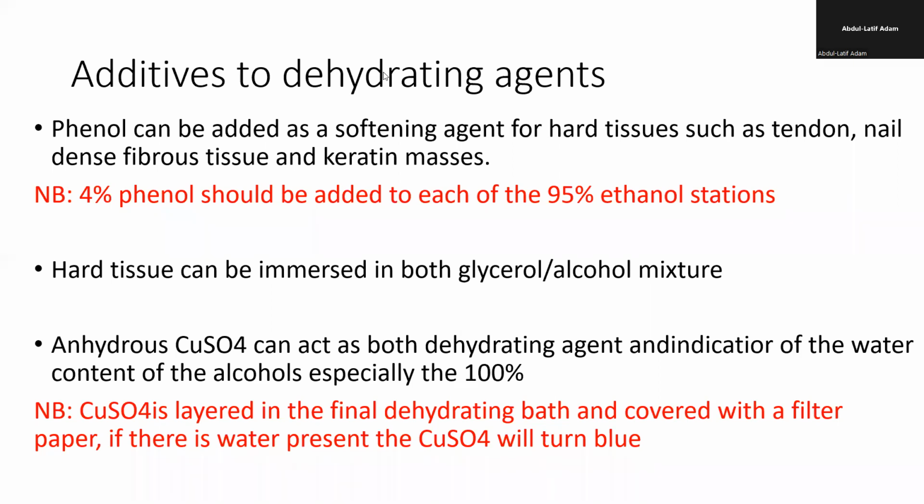Okay, so as I was saying, you add these softeners, so glycerol or phenol. So usually you use 4% phenol, or you use equal volumes of glycerol and the alcohol. So usually you add it to the last part, or the last part one.